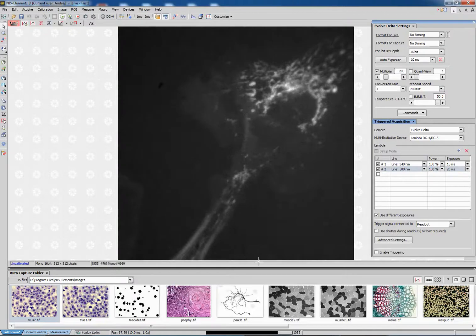So at the moment we're running the camera freely at around 67.5 frames a second. We're going as fast as we can, and what we can do just simply by enabling triggers here is now operate in smart streaming. So now we're doing both channels, and we're actually getting out what down here says 28 frames a second, but remember that's 28 frames a second of both of those images, both of those channels together. So we're getting 28 images that are made up of two different components, the two different channels, which means effectively we're running at about 57 frames a second, which is pretty cool.